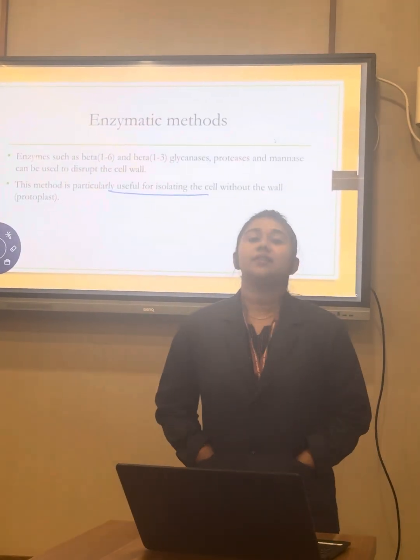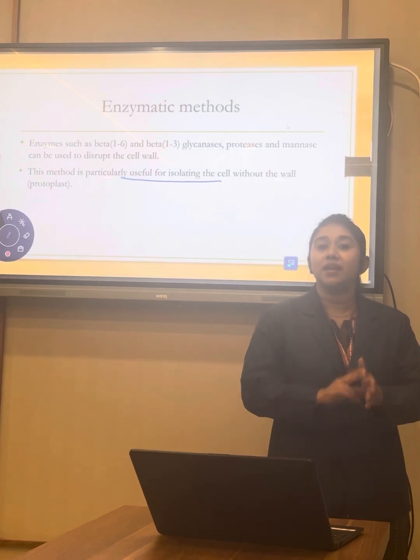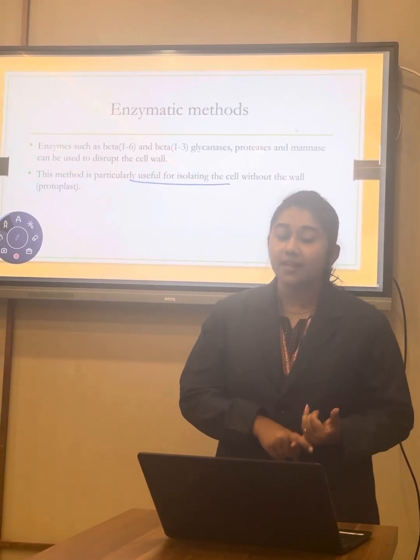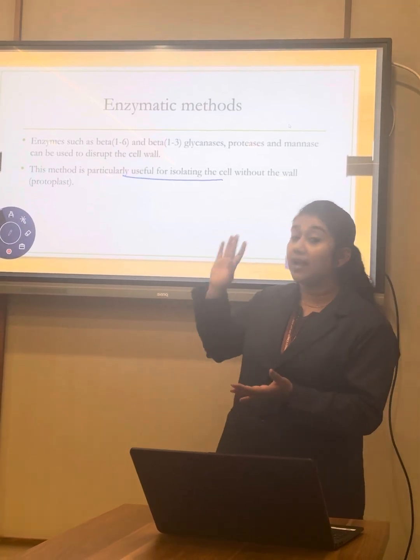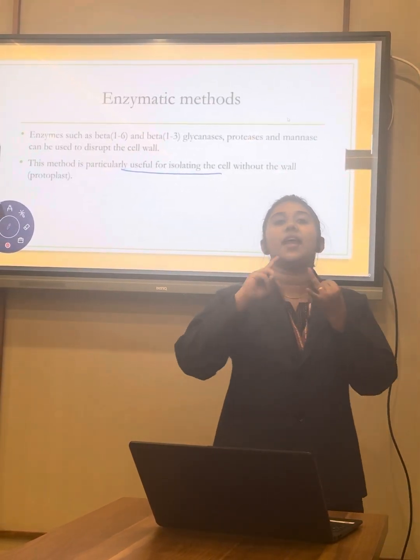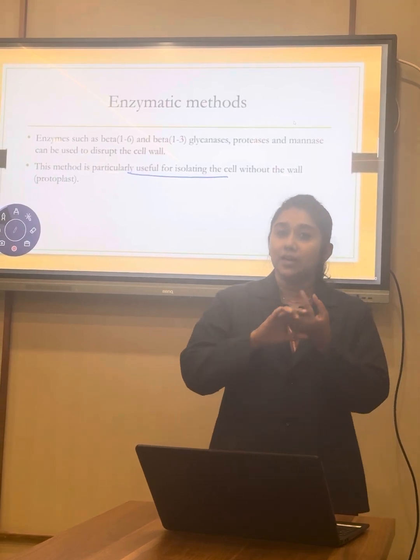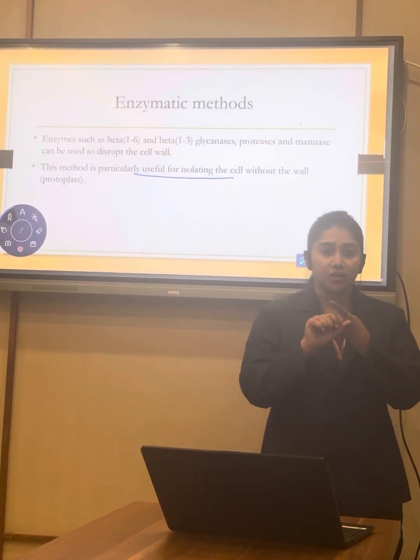So these are the cell disruption methods. Cell disruption methods are mainly of two types, mechanical and non-mechanical. Non-mechanical is classified into three types: physical, chemical and enzymatic. And the physical method contains freezing and thawing, microwave, etc.